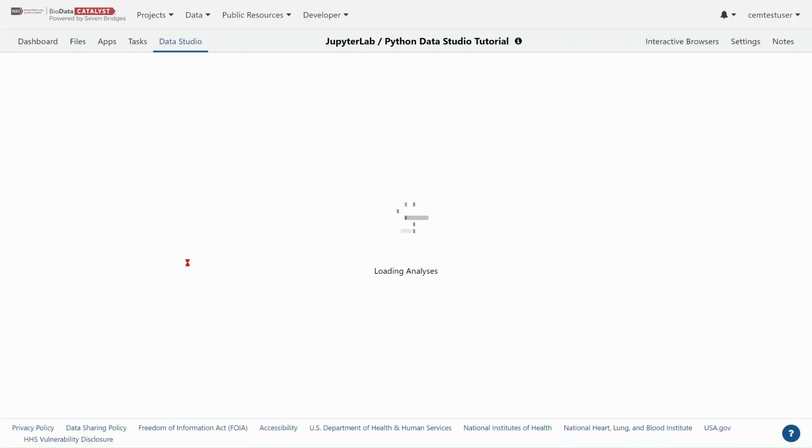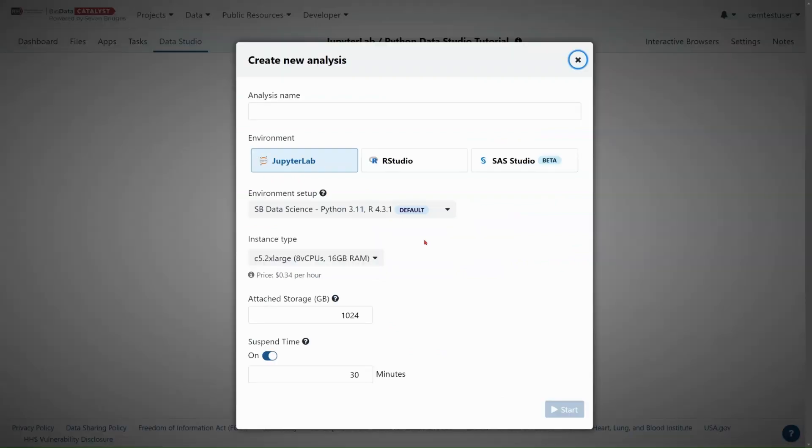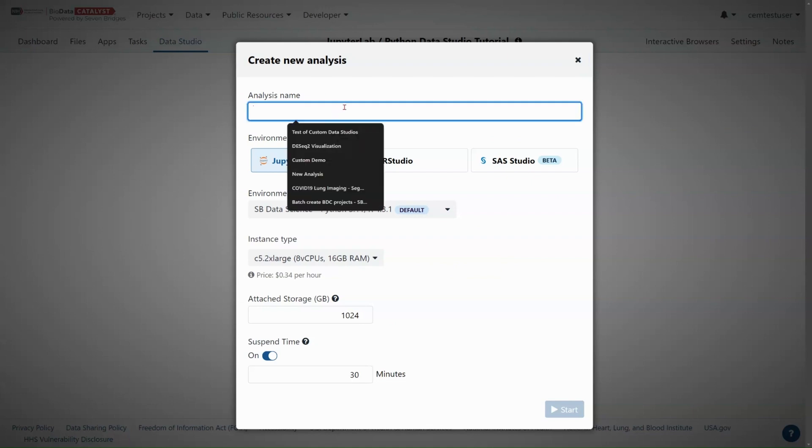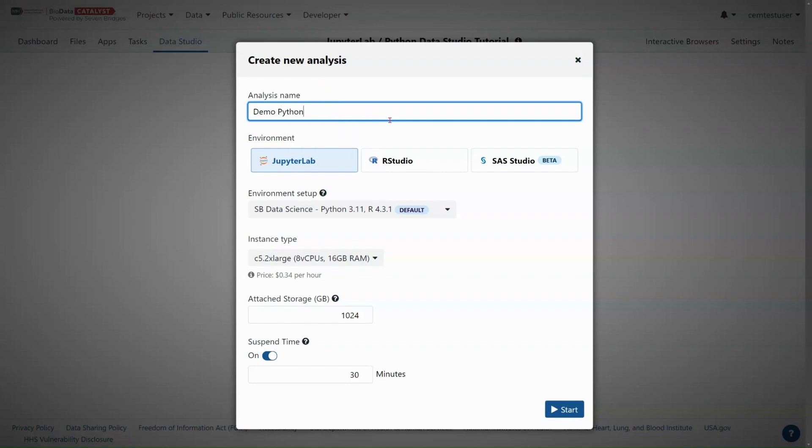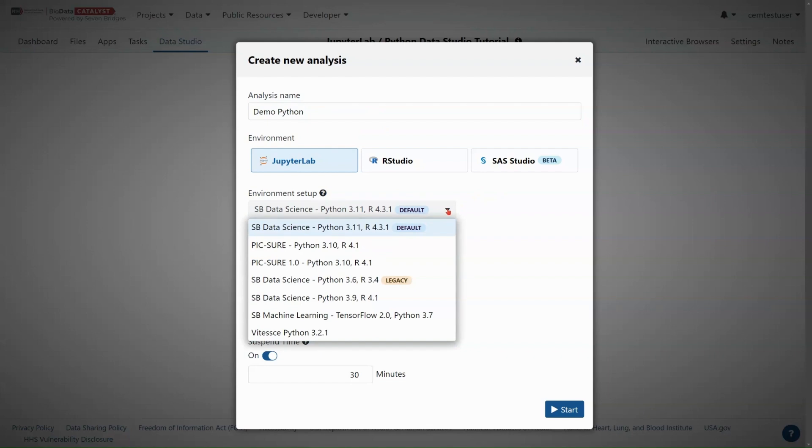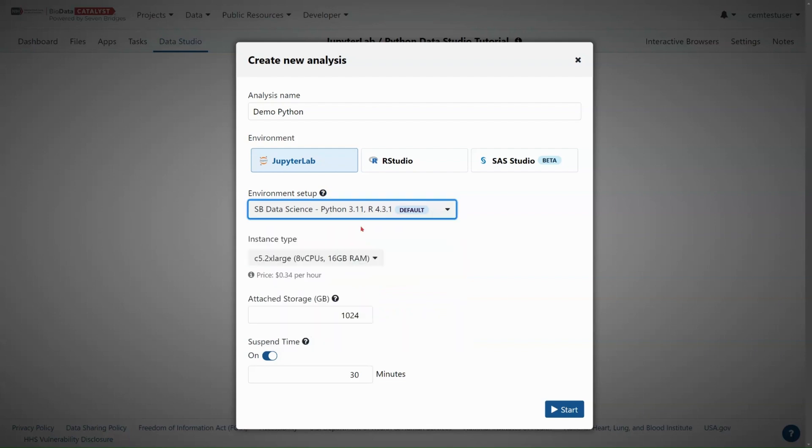The first thing that I need to do is create a new analysis. You'll see three environment options here. Select JupyterLab. We're going to name this new analysis demo Python. And the first choice we get to make is in the environment setup. In the environment setup here, we have a few options for different pre-installed tools, including a TensorFlow environment for machine learning and the PIC-SURE environment for integration with Biodata Catalyst powered by PIC-SURE. For now, we are going to use the SB Data Science Python 3.11 R 4.3.1 default environment.